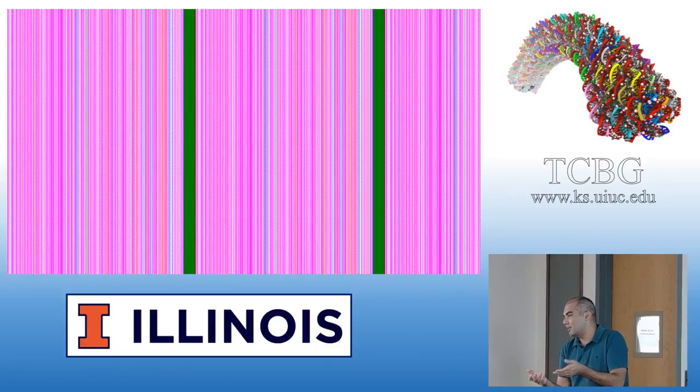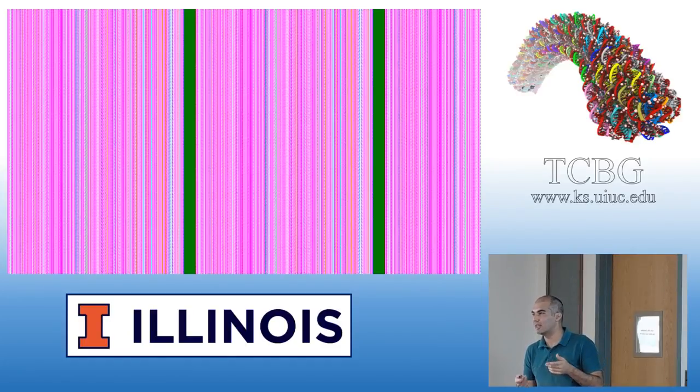So there's all sorts of cooperativity among all of those. Once some of those come there, the others hover to the end and pull together. It's not really a one by one kind of deal. It's just a model, just a tool. It's not really trying to predict anything, but trying to do its best.